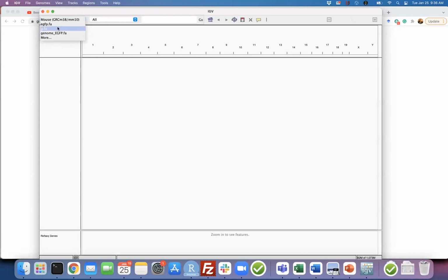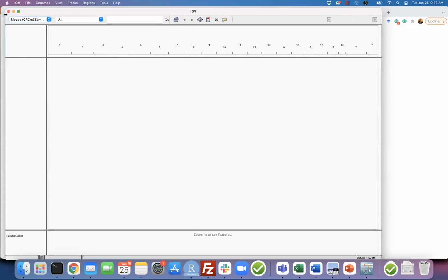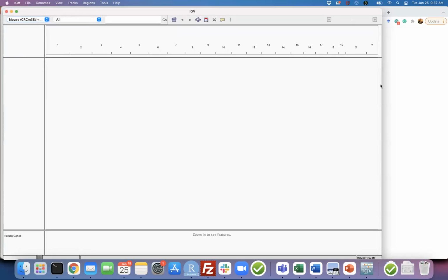Just for one gene, I wanted to see the distribution of the reads on that and how it worked. Because there are sometimes some problems, you map something there and it doesn't work how it's supposed to work. That's why you need to check those things yourself, with your own eyes. IGV is very good for that. And also you can use the UCSC Genome Browser. There's an upload there too.